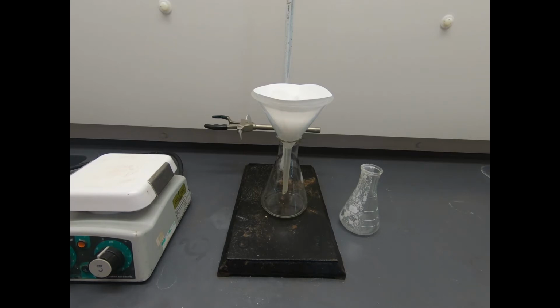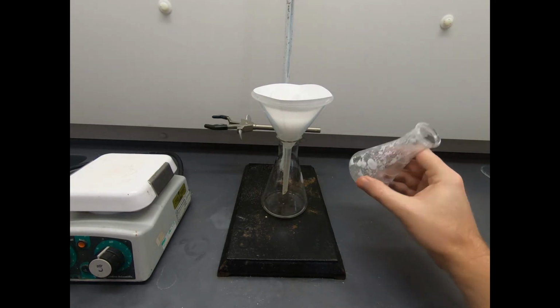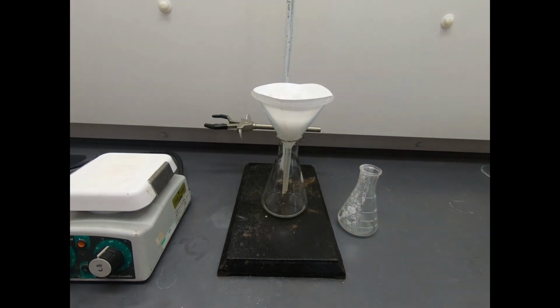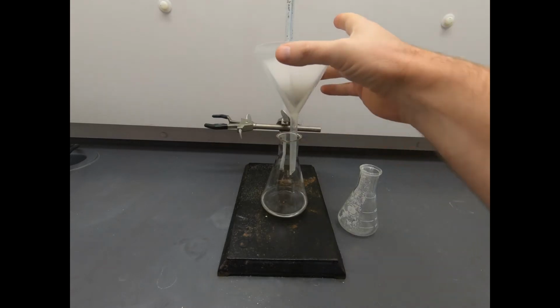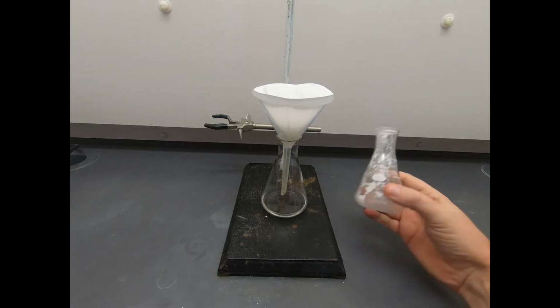So we're going to let this drip, and this is going to take a few minutes, so we don't have to show all of this, but we'll wait till this is fully dripped through, and then we'll talk about what we're going to do about this residual solid and any residual product that might be in here, and stuff that might be caught in the funnel. Well, this has finally dripped down a whole bunch. It's essentially all the liquid has come through the funnel. Now we have these solids to deal with.